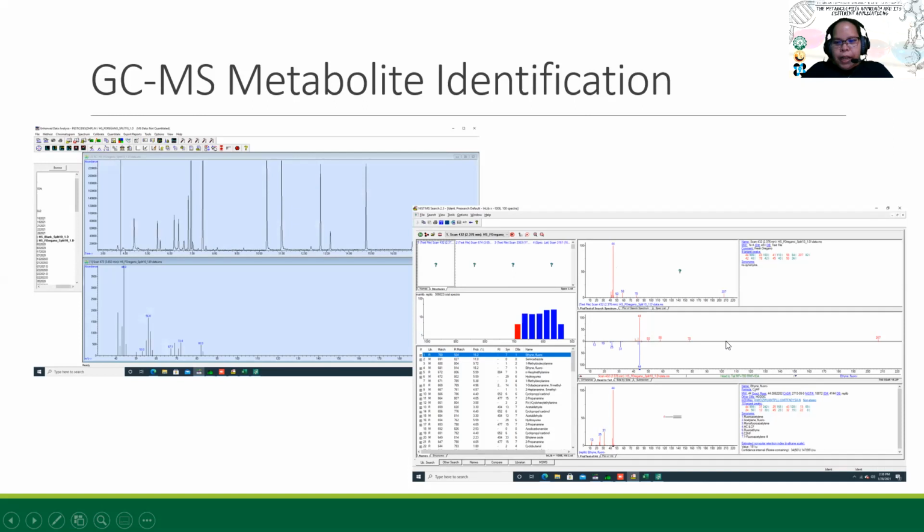And of course you need to assess kung ano ba yung level of matching niya. The software will provide you the scores based on the match. But of course, you also need to sometimes check and confirm na ayos ba talaga yung match, because there are times that they might not be really matched in some cases.